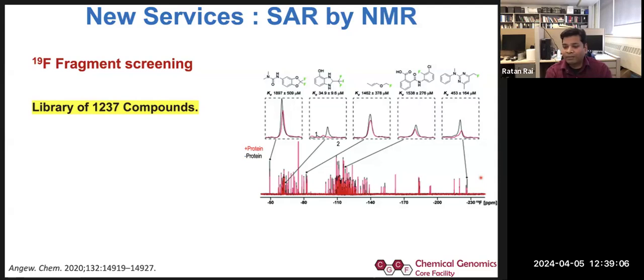Because sometimes it does happen that, depending on what kind of structure you start with when you are screening, whether it's an NMR structure, a cryo structure, or an X-ray structure, if it is not an NMR structure, the flexibility is not there. So you might find a really good hit through in silico modeling, but if you look at it in a real biophysical technique, it won't be as good as it seems in in silico modeling.